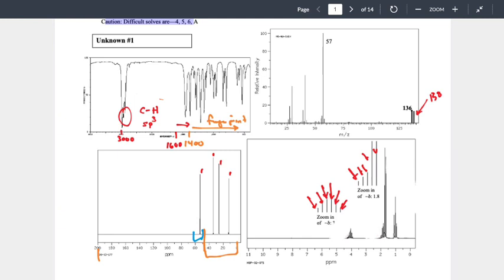You realize this doesn't look any different. Here's where it starts to kick in. Here I get 3 signals. Are they all the same intensity? Nope. The middle one is twice as high as the ones on the side. So what that's going to look like, drew that kind of horribly, is that. Then what happens? Okay? And in each of these cases, hopefully what you notice is that you're getting kind of a symmetric system behind it. That's the signal splitting out. It splits both lower and higher.